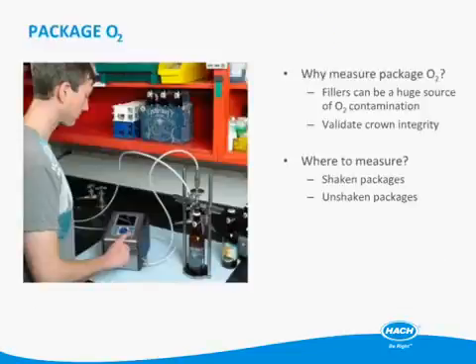The reason that I think it's important to measure package O2 is because you can really look at things and validate exactly what's happening. You can look at your O2 at the base of the filler. You can look at the O2 in an unshaken package after it's been filled. And these two values, if you take your unshaken dissolved oxygen minus what's at the base of the filler, you will get your filler pickup value. You can shake the packages too, and you can incorporate the headspace gas by shaking, and that really gives you the ability to calculate TPO from a dissolved measurement.